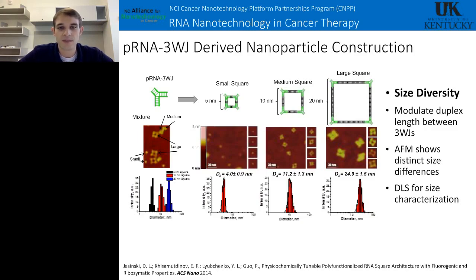And then based on our AFM and our DLS data, we get particles that are very similar in size to what we actually designed. So using this method, we can very easily generate different size and different shape nanoparticles, which have some great applications for in vivo work. And that's actually something that we're exploring pretty intently right now.